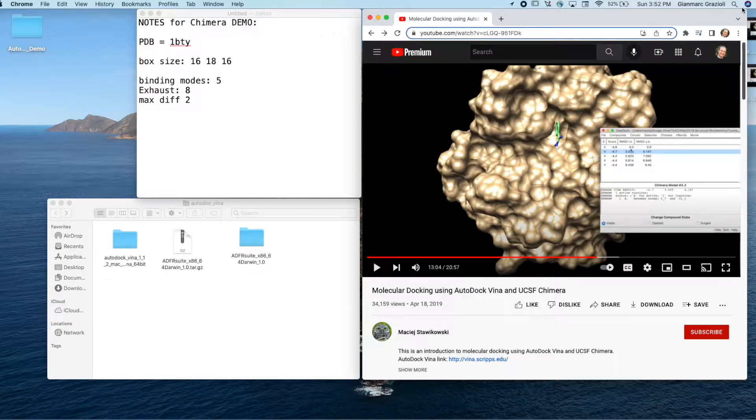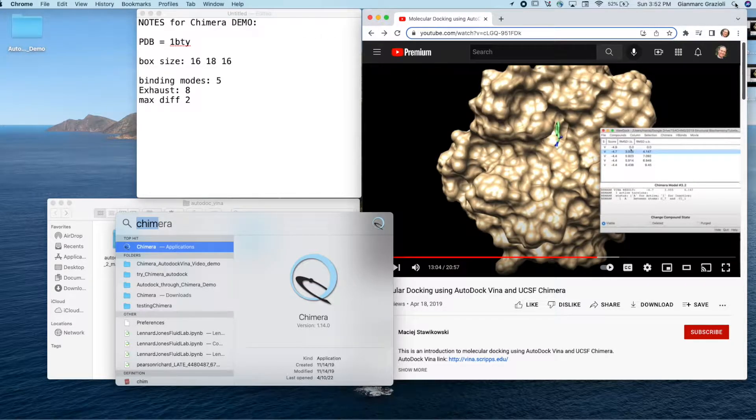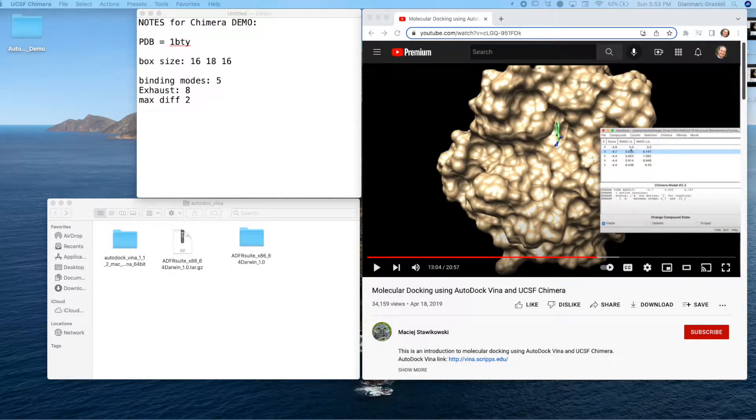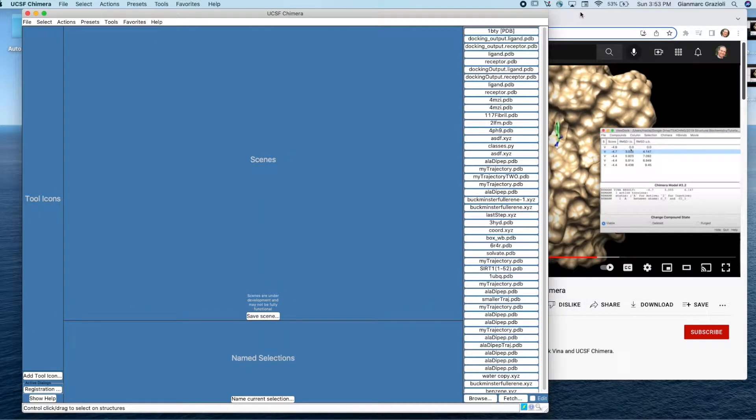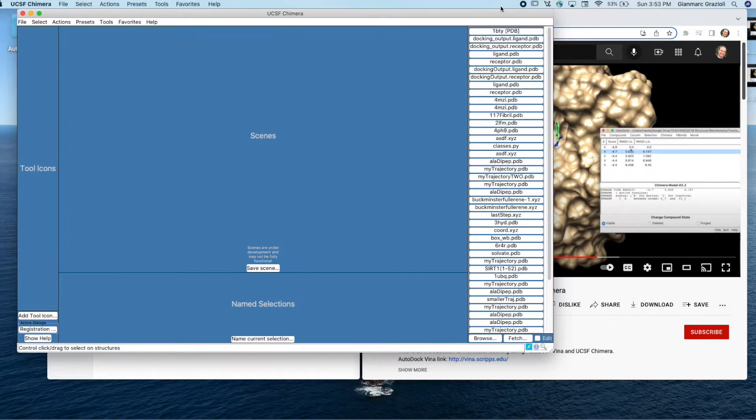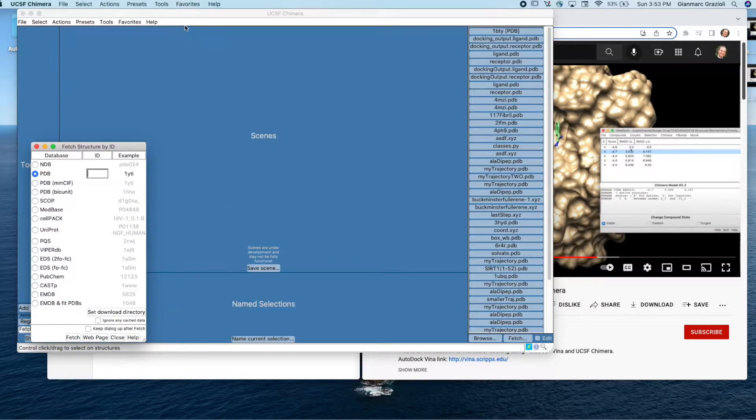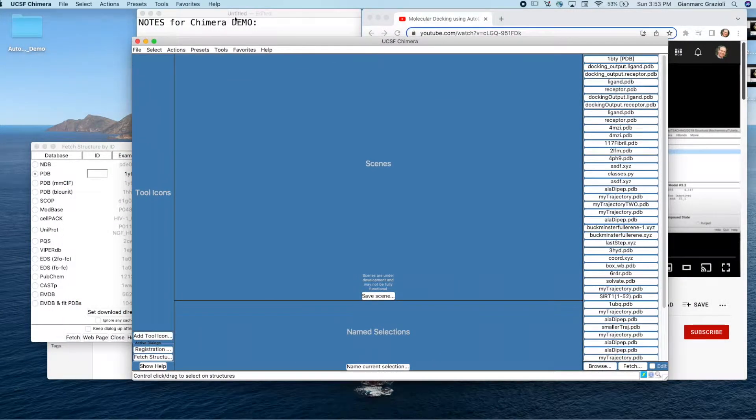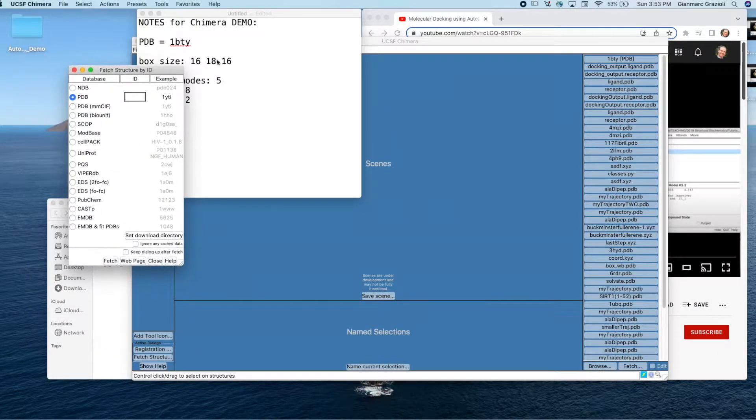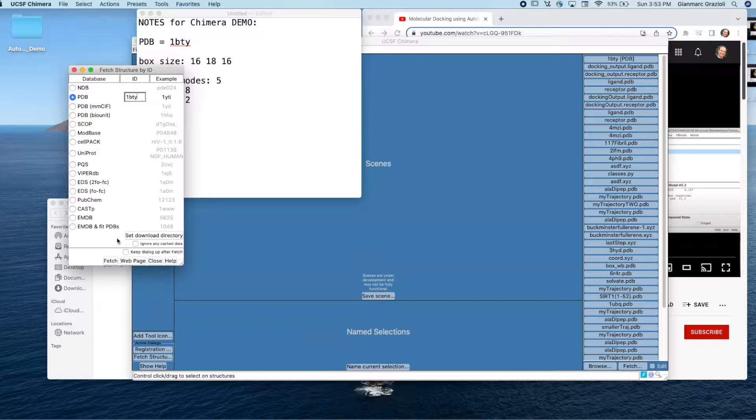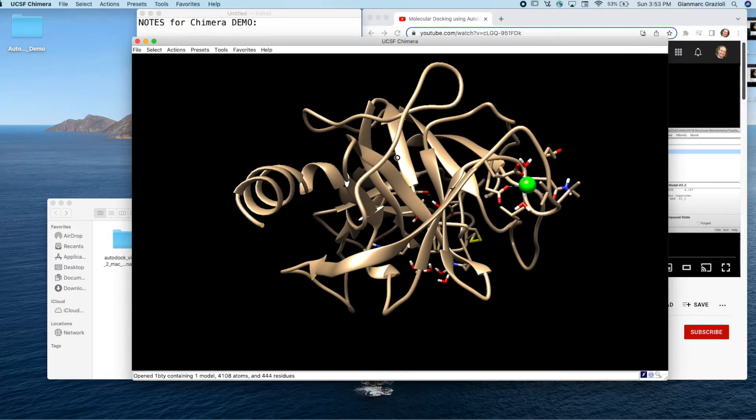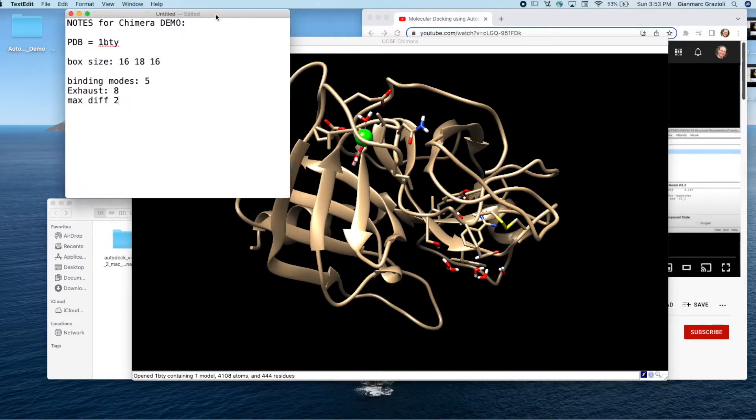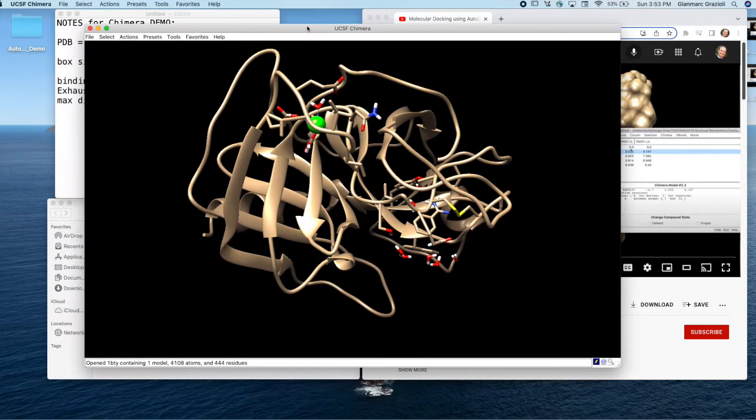Let's open up Chimera. Chimera has launched. Now if you look at the very bottom here, there's this thing that says Fetch. If you click on that, the structure from the tutorial is 1BTY. So if I type 1BTY here and then I click Fetch, this is the same one from the tutorial. This is really nice that Chimera has this feature that you can load something so easily.